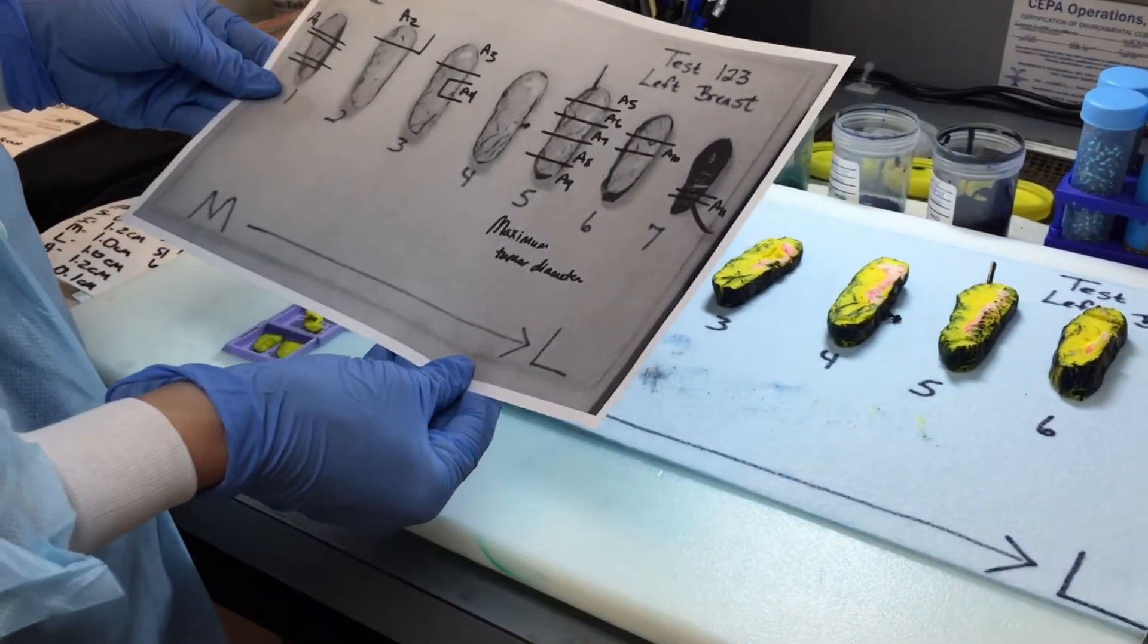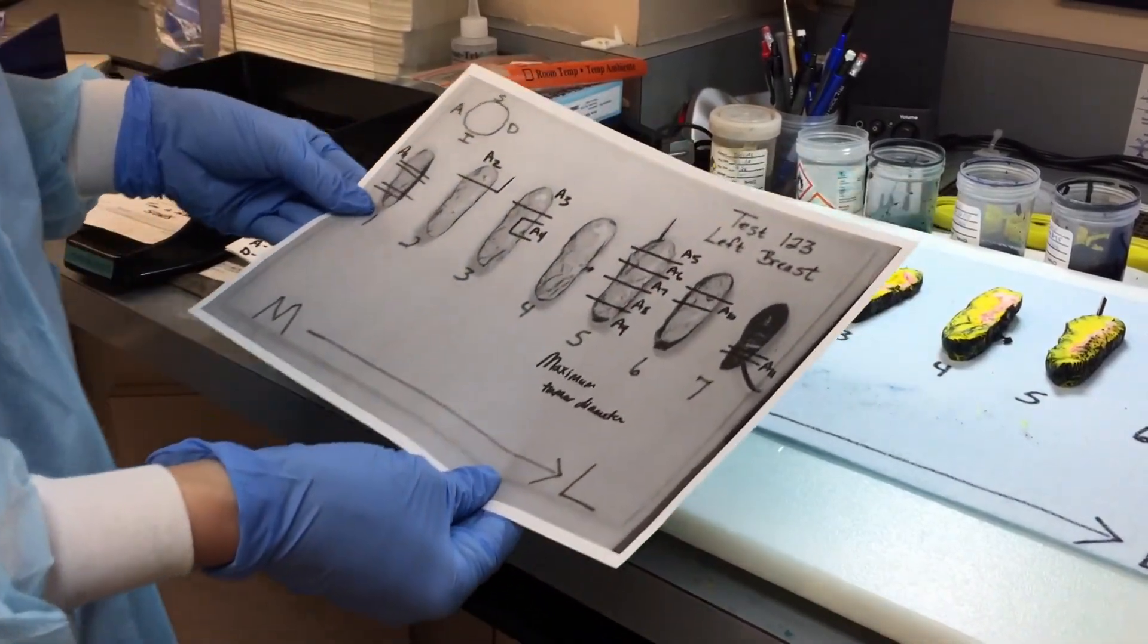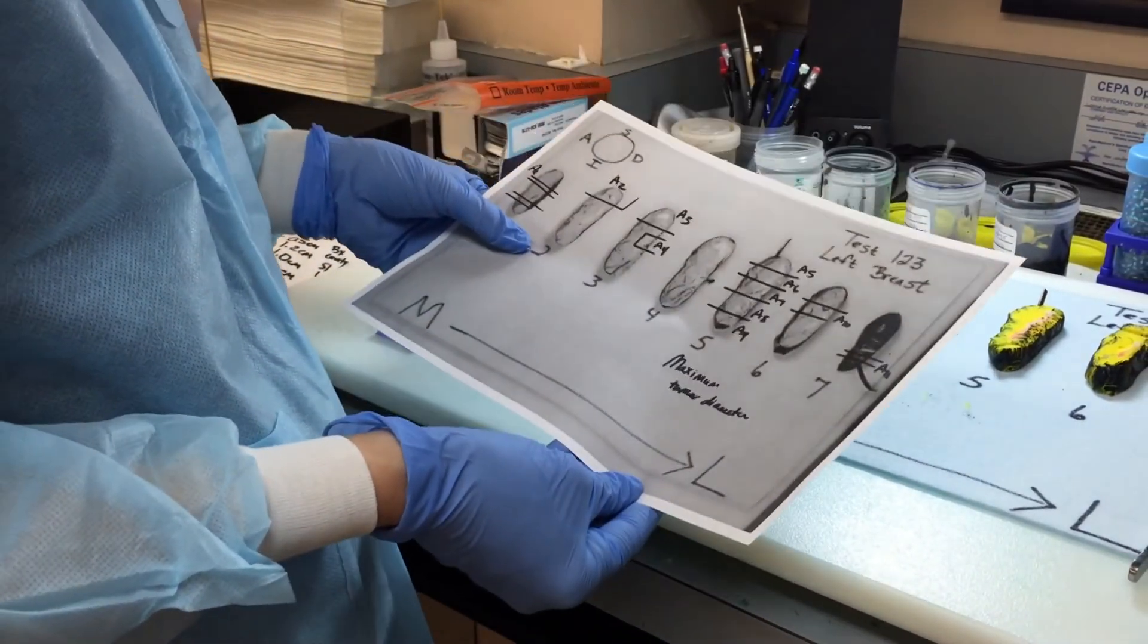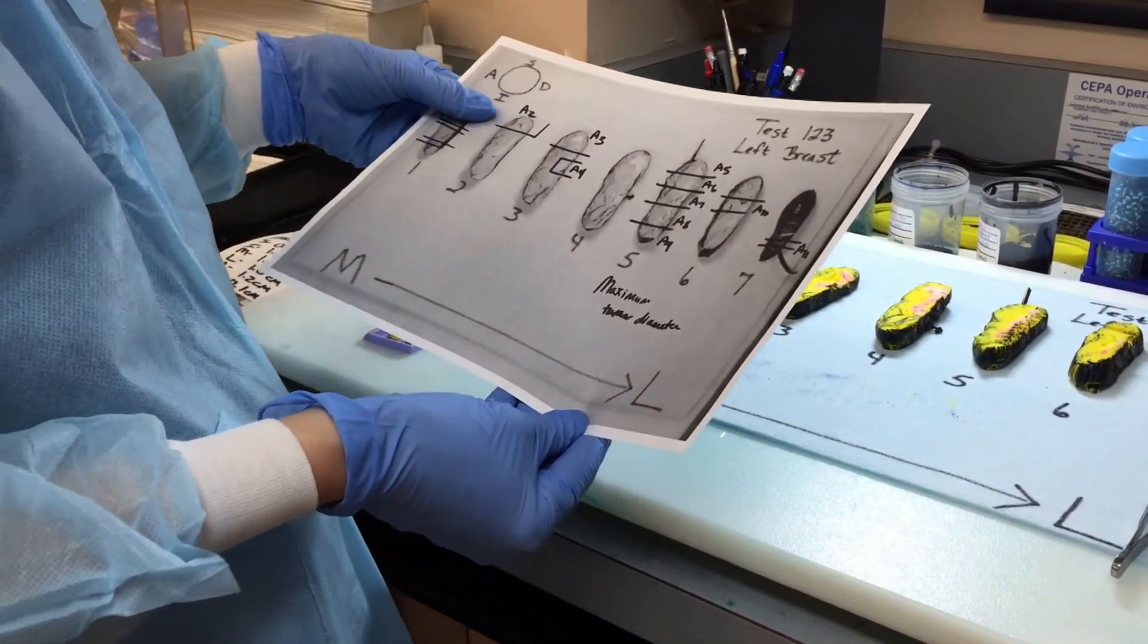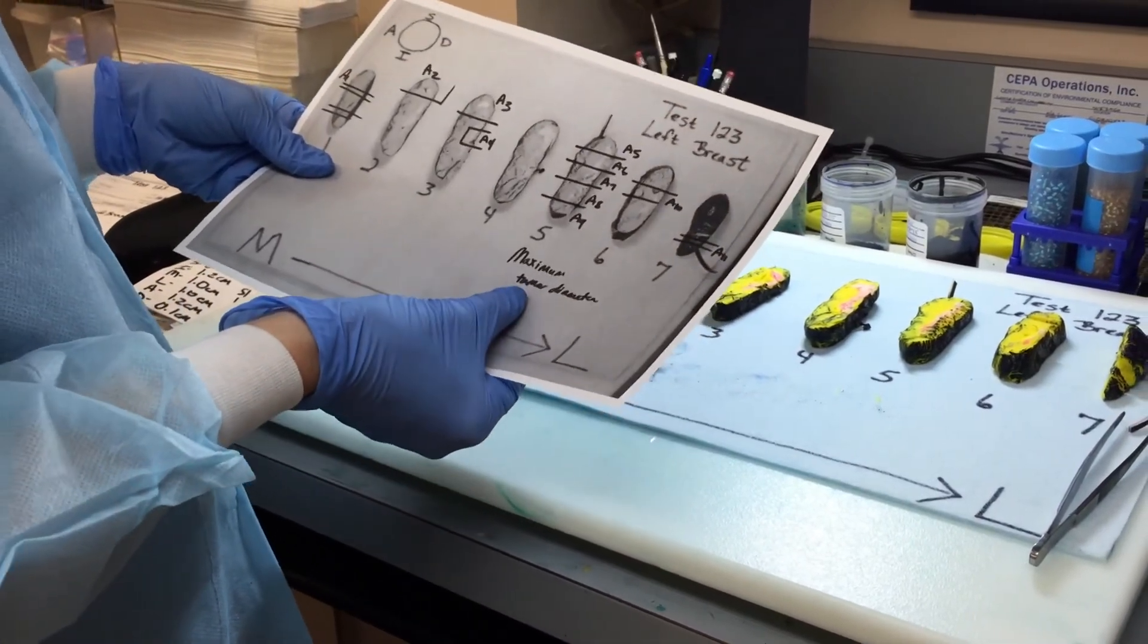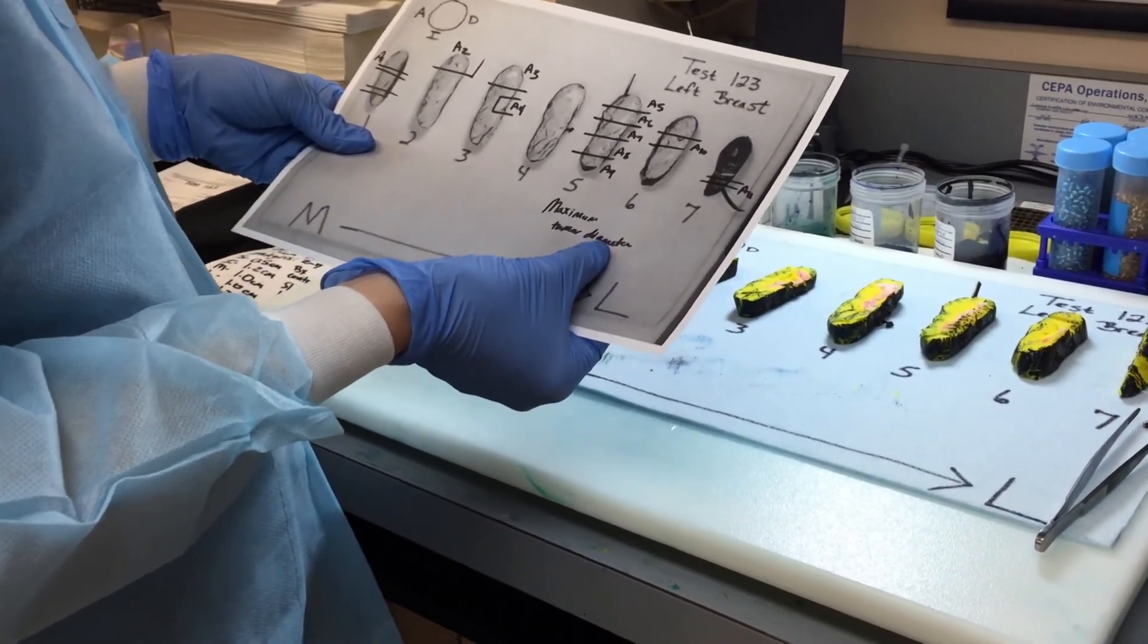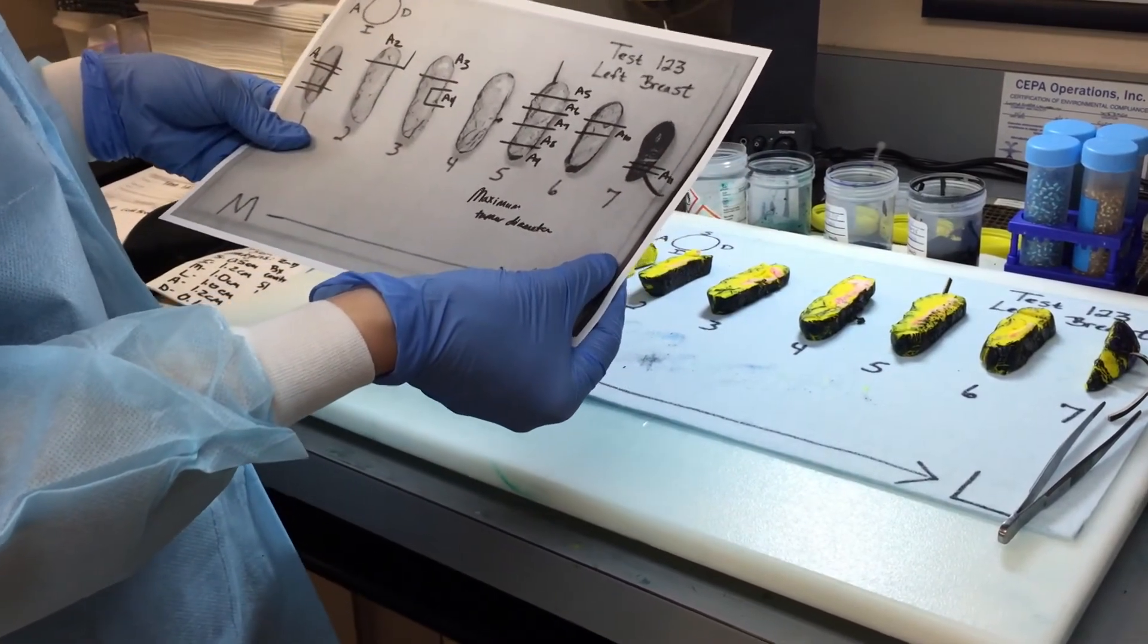And then we go on to dictate our block key. So we use the sheet that we've already made, but we also check our block key as well as looking at the breast tissue to make sure that everything is in check. So for the block key we have A1, slice number 1, representative perpendicular sections of the medial margin. A2, slice number 2, with nearest superior margin. A3, slice number 3, with nearest superior margin. A4, slice number 3, with nearest deep margin. A5 through A9 is slice number 5, one contiguous section, with maximum tumor diameter. A6, or sorry, A10 is slice number 6, representative section of previous biopsy cavity. And A11 is slice number 7, perpendicular section of lateral margin.